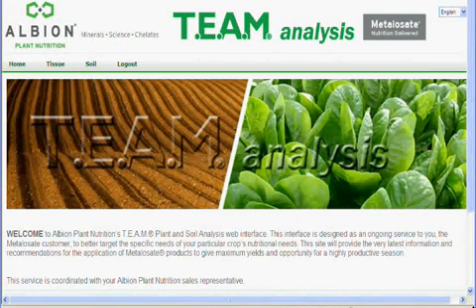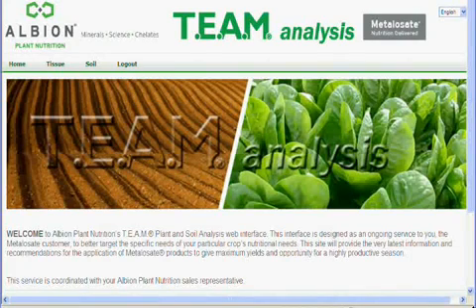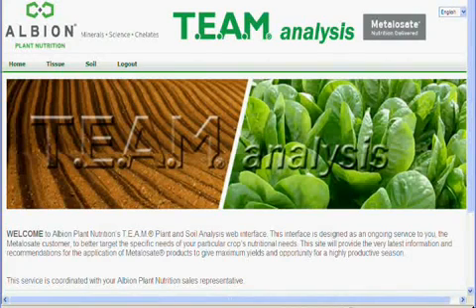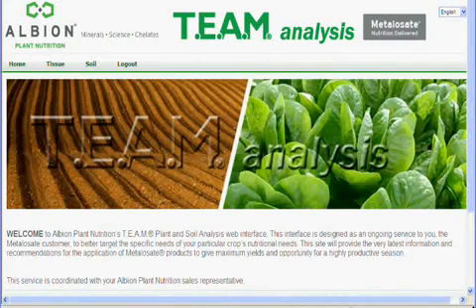Welcome. Now that you have successfully logged into the team analysis website, it's time to look at how to log sample data into the site. This training will give you a quick tour of the website, demonstrate how to enter a sample, and then export a team recommendation report.